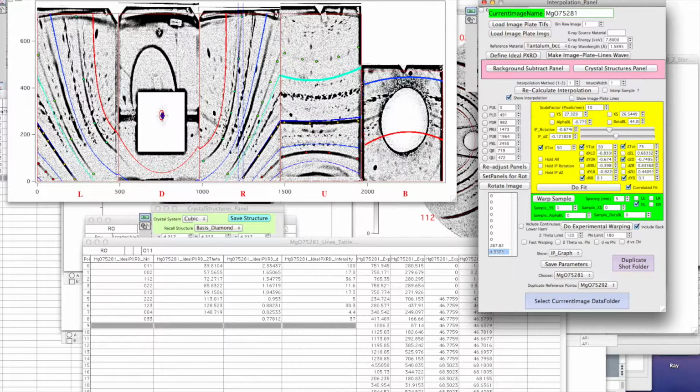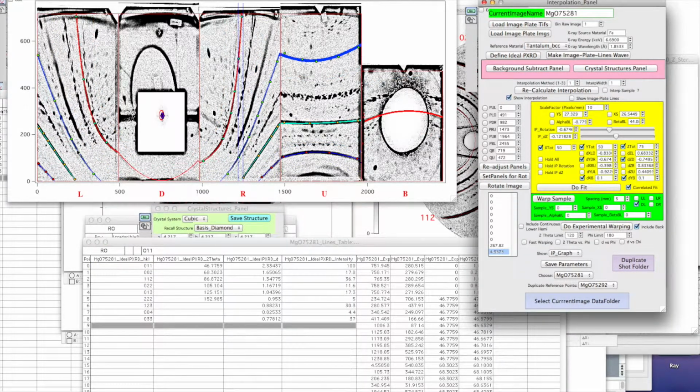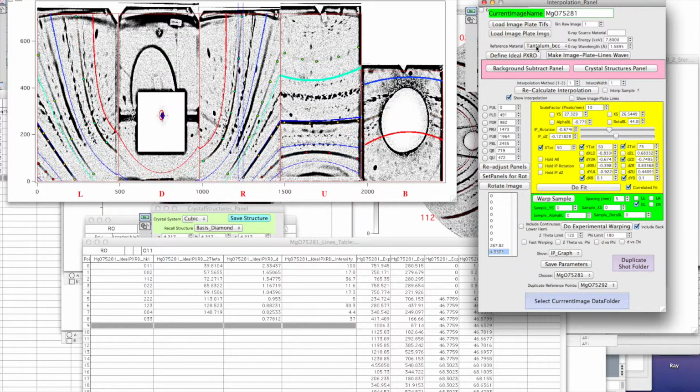So let me just put in Fe here again. Okay. Yeah, so it's right beside. That is the driven line, okay, in this particular shot. I was just wondering, is there anything else? So if you go back to the helium beta, you would see this line, that would be this one.